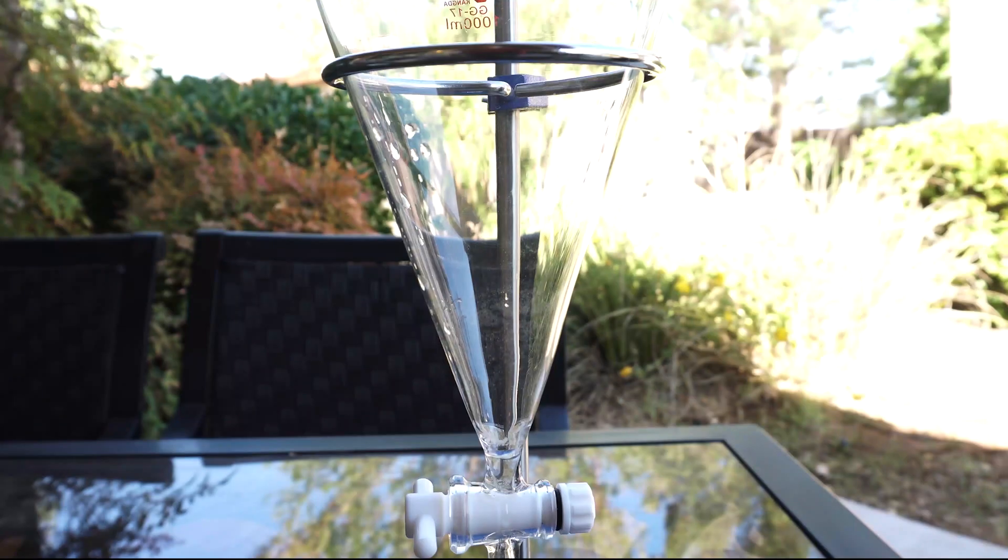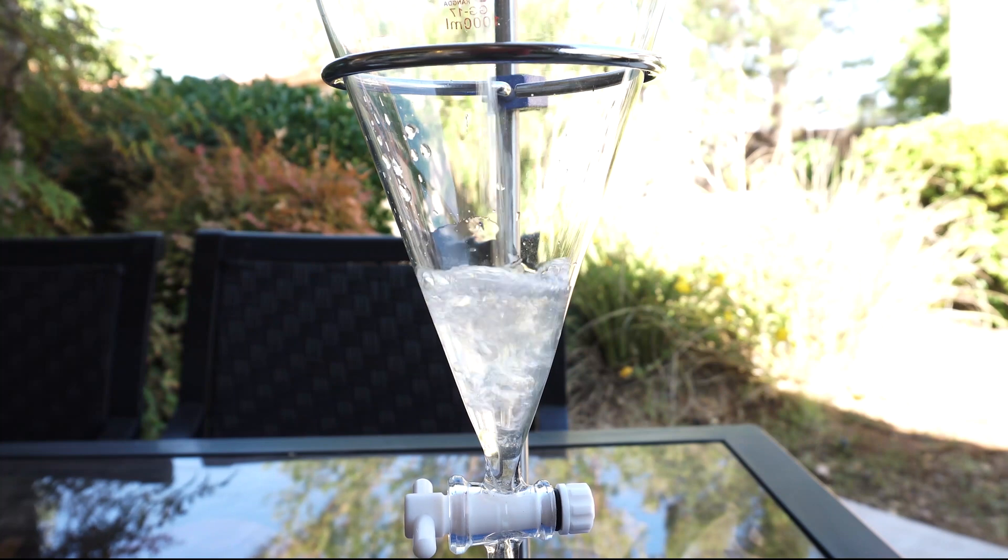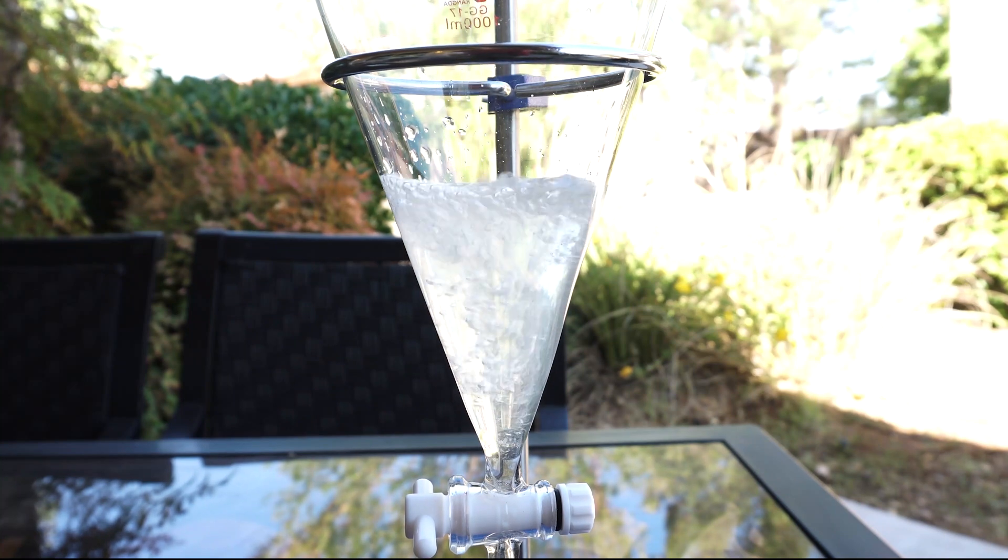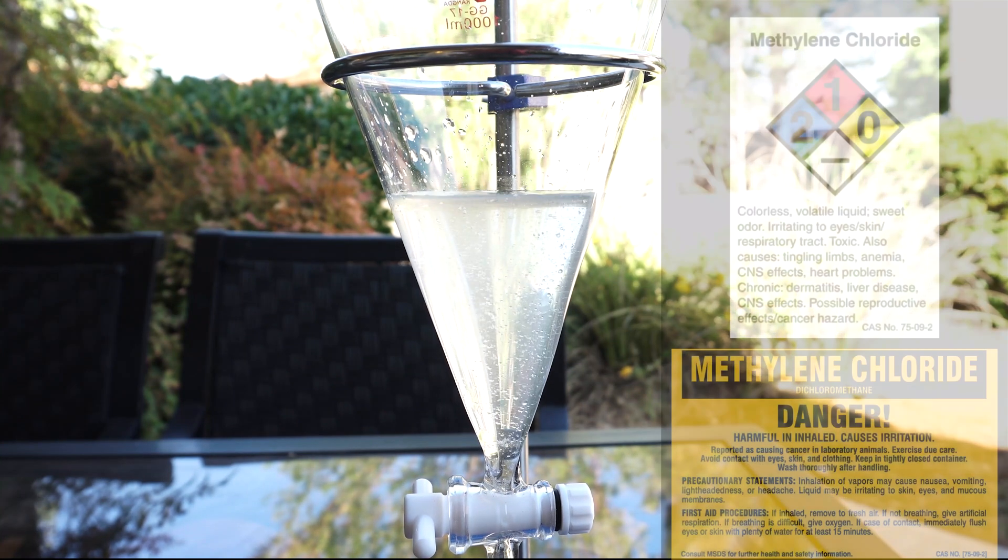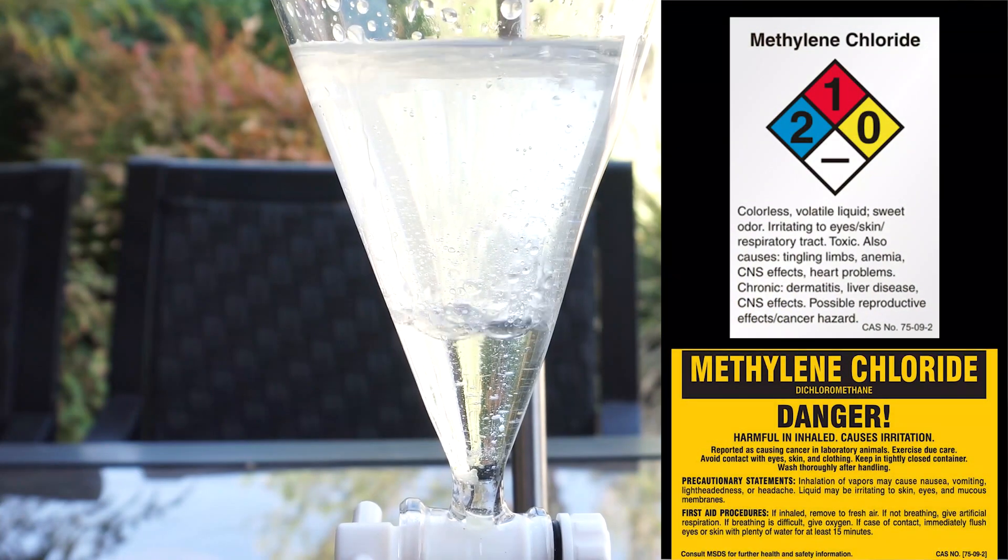Now comes the fun part. I pour about 150 milliliters of the distillate into my separation funnel, followed by 25 milliliters of methylene chloride or DCM for short.